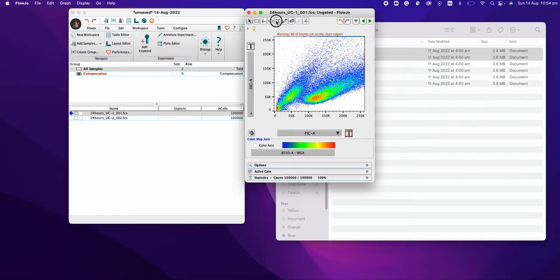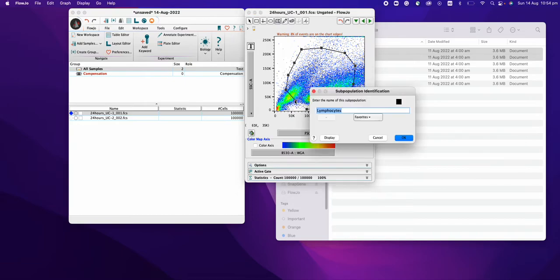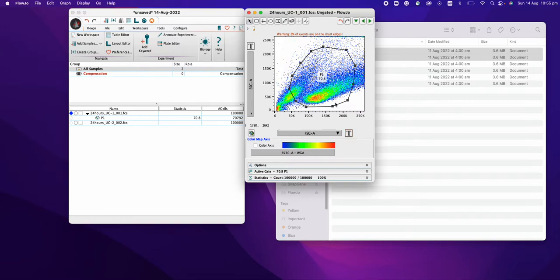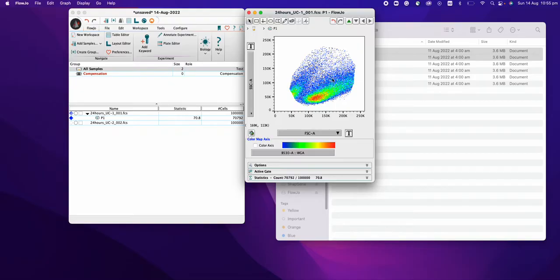We'll have to clean up using any of the tools here, but I'll just use this one because it's easy. This is the first stage of cleaning up. I'll select this as P1 — population one. Maybe we can change the places as well, what you would like to see. Double-clicking will create a clean page.